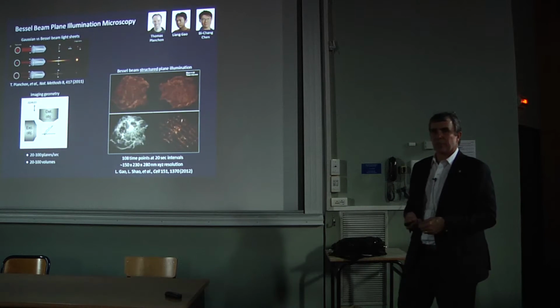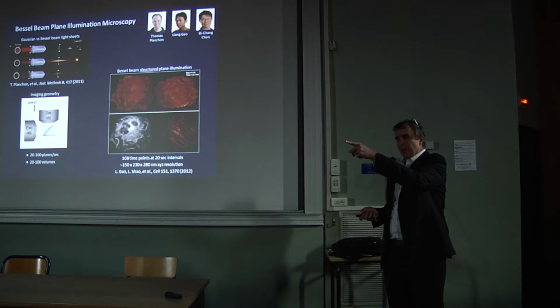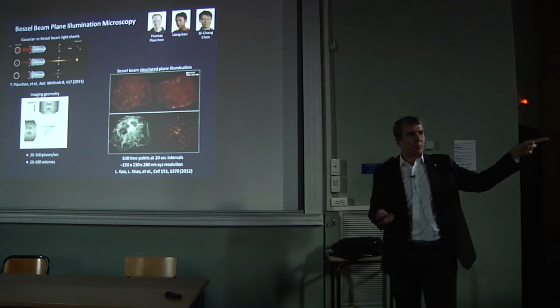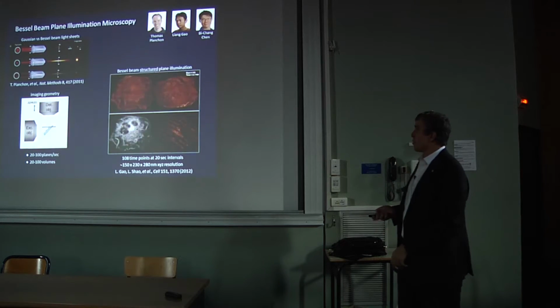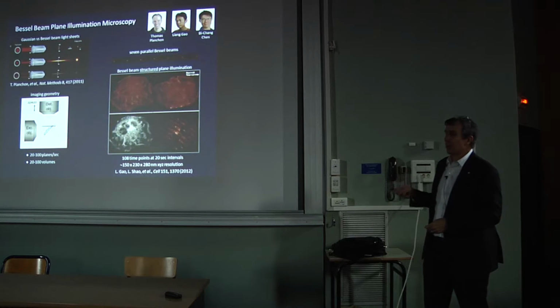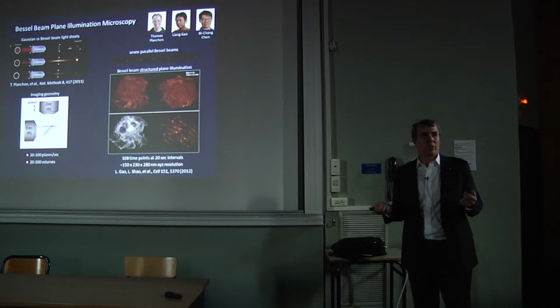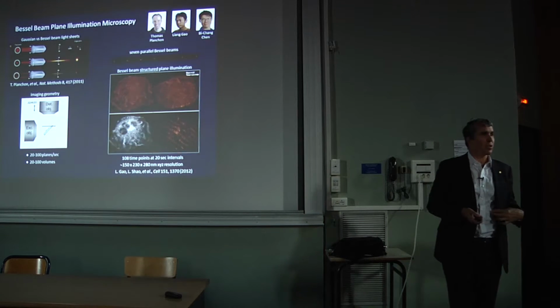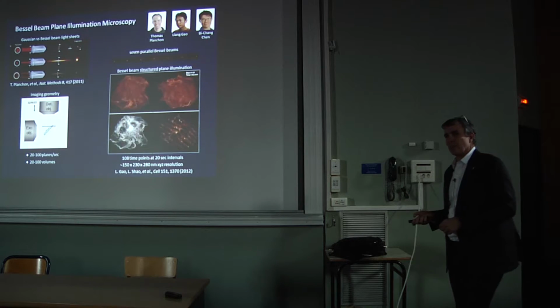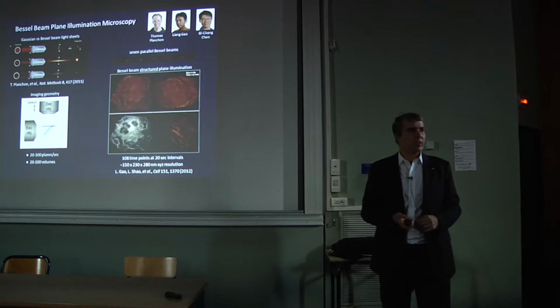One of the problems in doing that, though, is it took physically too much time to use a galvanometer to step the beam across that many times. So what we did is we used a diffractive optical element to create a parallel array of 7 Bessel beams, so each one would have to go only over 1/7 of the field of view. That took care of the speed problem, but what was shocking was how much less toxic it was to use 7 beams instead of 1.